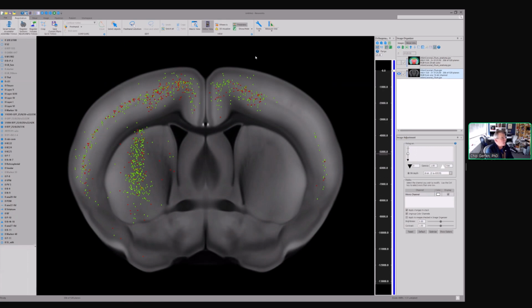After the 3D volume of the brain has been generated, we take that volume into NeuroInfo, into the next step of registration. We register those serial sections, and then we register them as a volume into the Allen atlas. So these are showing the location of the neurons that have projected the D1 neurons in the cortex, the injection site where the rabies is injected into the striatum, and those neurons are labeled.